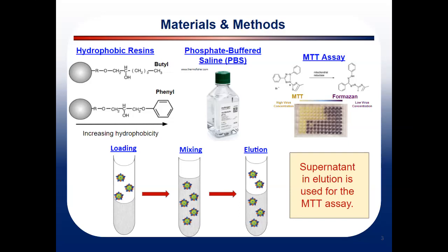To obtain the difference between adsorbed and unadsorbed virus onto the resins, an MTT assay is performed. The MTT assay is a colorimetric method based on the determination of cell viability. It measures the concentration of virus left unadsorbed after mixing with the resins and allows the hydrophobicity of the virus to be tested.